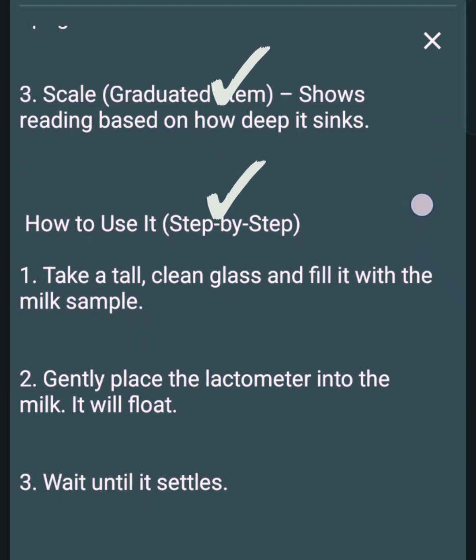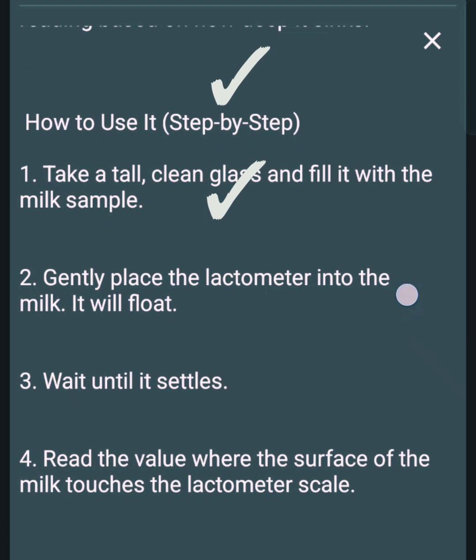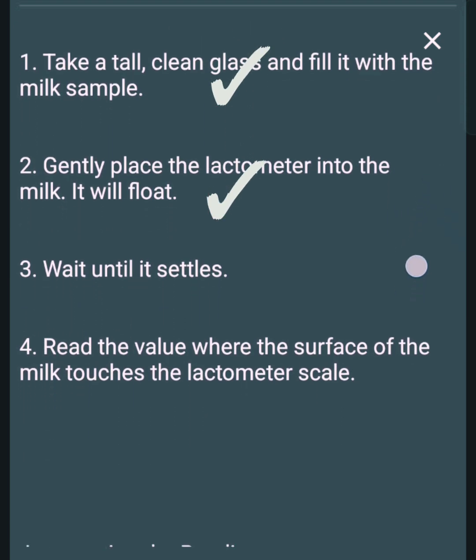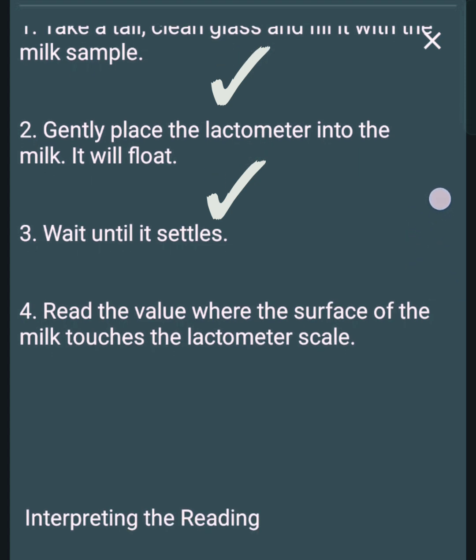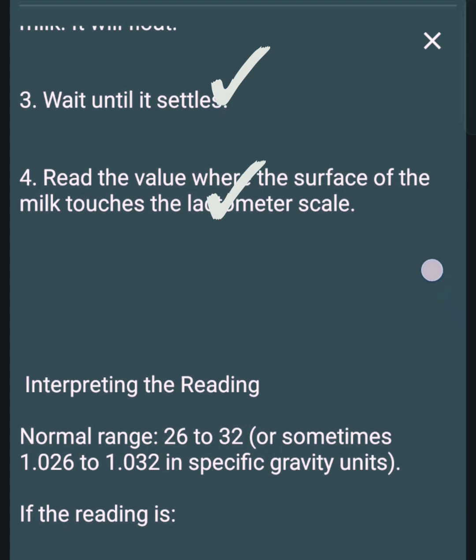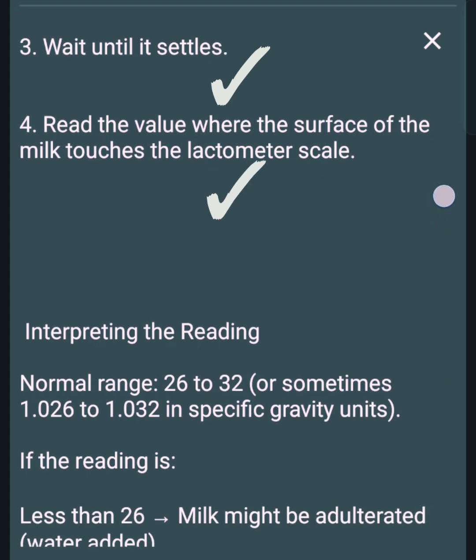How to use it, step by step: 1. Take a tall, clean glass and fill it with the milk sample. 2. Gently place the lactometer into the milk — it will float. 3. Wait until it settles. 4. Read the value where the surface of the milk touches the lactometer scale.